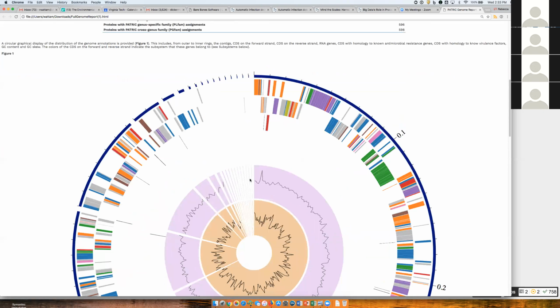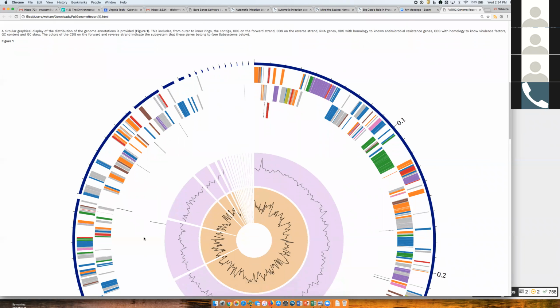And so with GC content and GC skew, if you're looking for lateral transfer, if you can see where you've had a change in the GC content and you can see that that's tied to a tRNA gene, then I would suggest go look at that because it's probably lateral transfer. But anyhow, I get excited about that, so I digressed. The next one in are the known virulence factors. You'll notice in my genome, there are none.